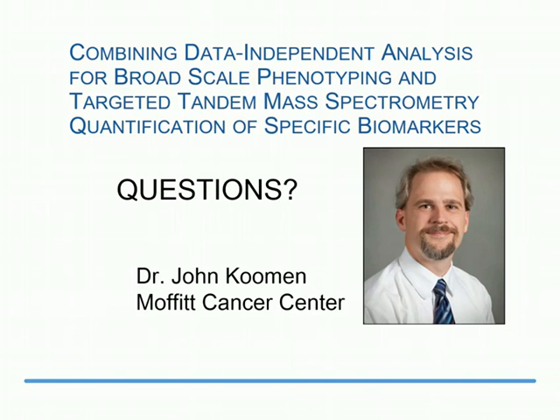We think that's also a good way to convert the lower confidence measurements, whether they be accurate mass and time without the MS-MS support, or even slightly lower than that, where you have accurate mass and time but poor isotope resolution and a very poor signal for the quantification. So we're trying to work on those different strategies and make sure that we get as much content as we can and to push all of it toward the higher quality measurements.